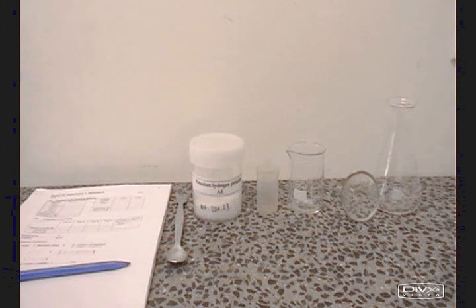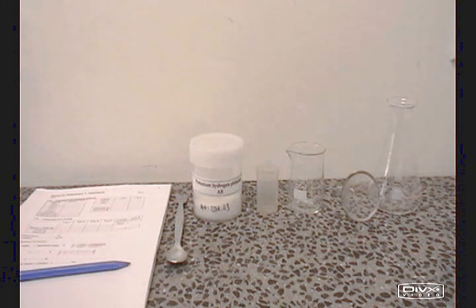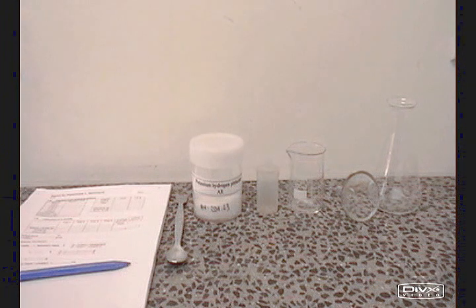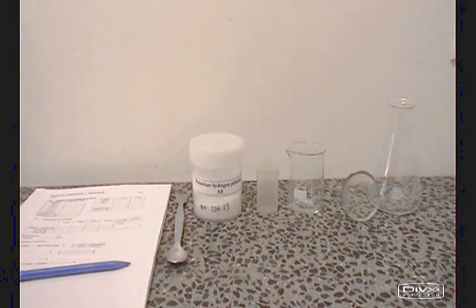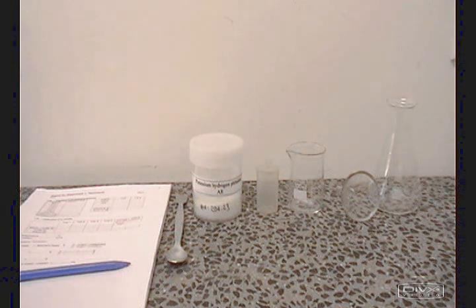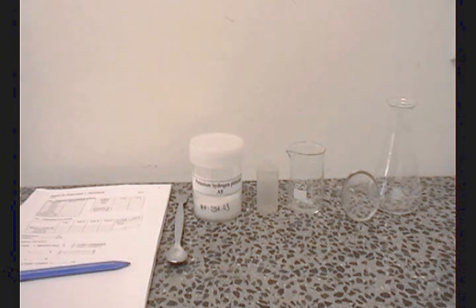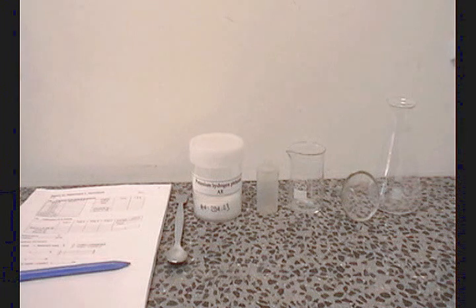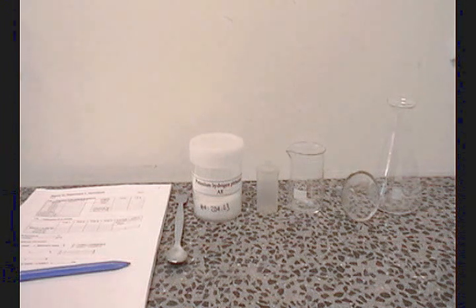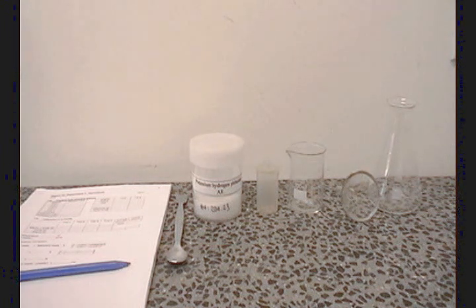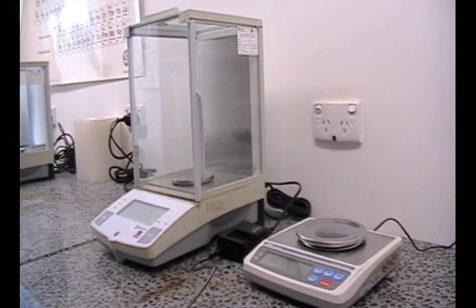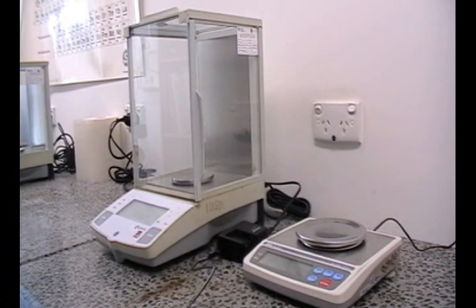The equipment that you'll be needing today, starting from left to right, is a lab diary, a pen, a spatula, the substance to be weighed, in this instance potassium hydrogen phthalate, a weigh bottle, a beaker, a funnel, a conical flask, also known as an Erlenmeyer flask, a top pan balance, and an analytical balance.